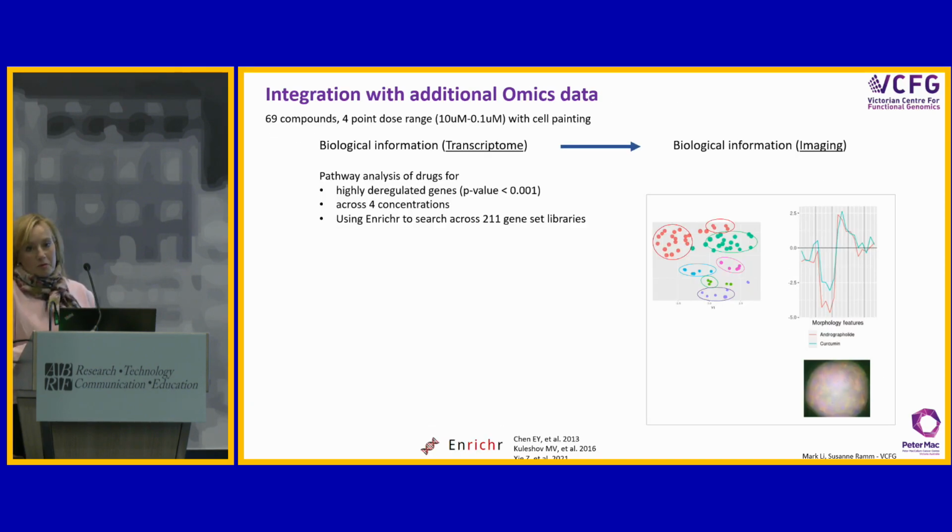And then it gets a bit more fun, because here's when we start to integrate our imaging omics. So I'm glad you coined that term, because we're calling this imaging transcriptomics when we play in this space. So the same screen that we set up, we've got our transcriptional information and we've got our biological information. So here the lead was, if we're going to do this multiplex analysis in 3D, can we cluster, and what do we cluster together? So we clustered these two compounds with this same profile.